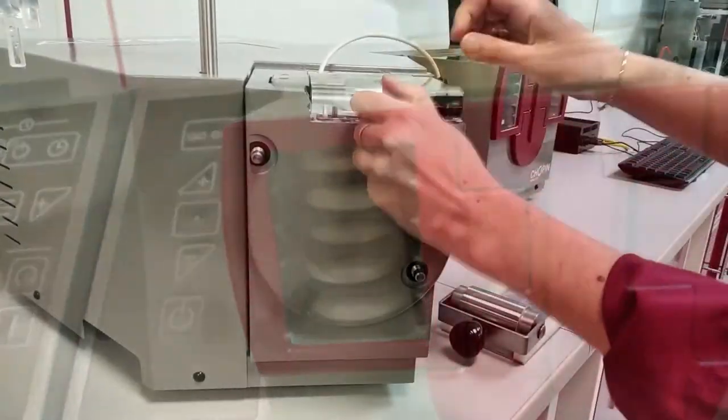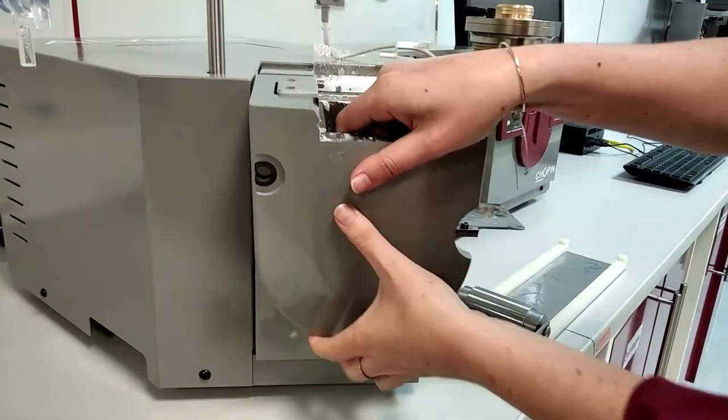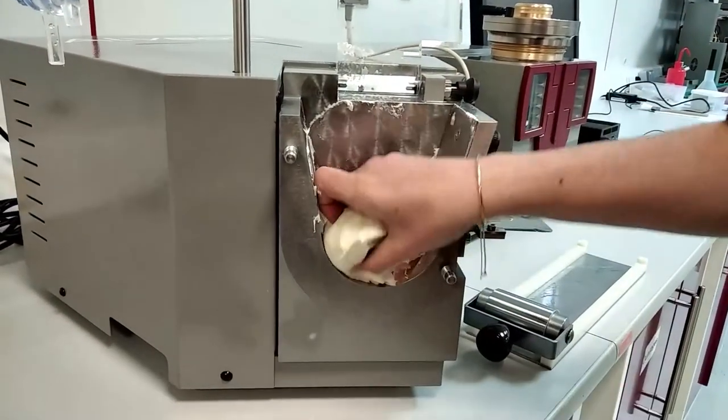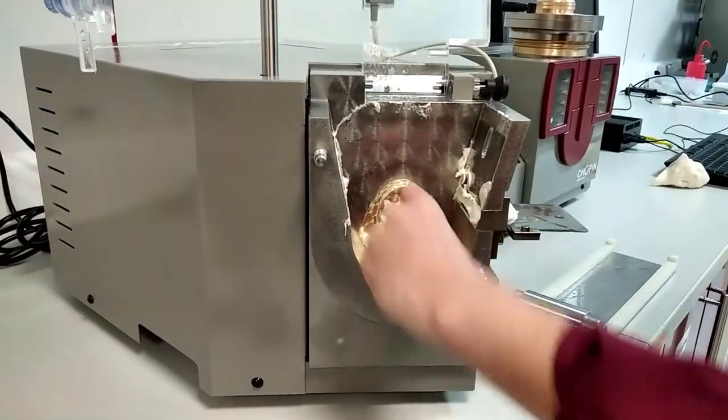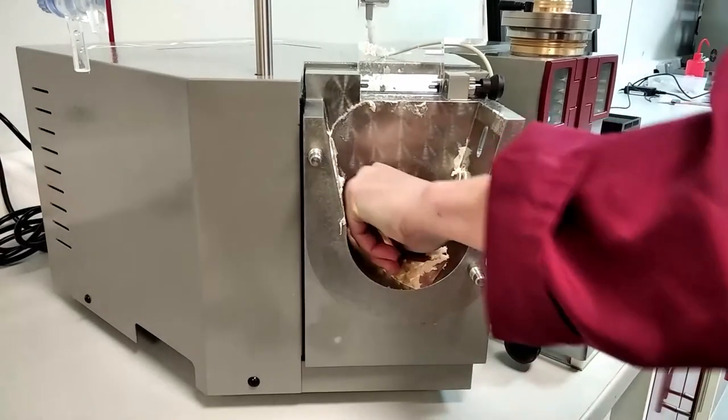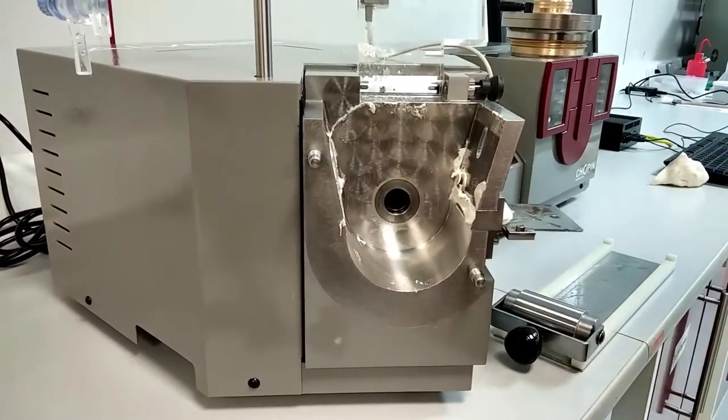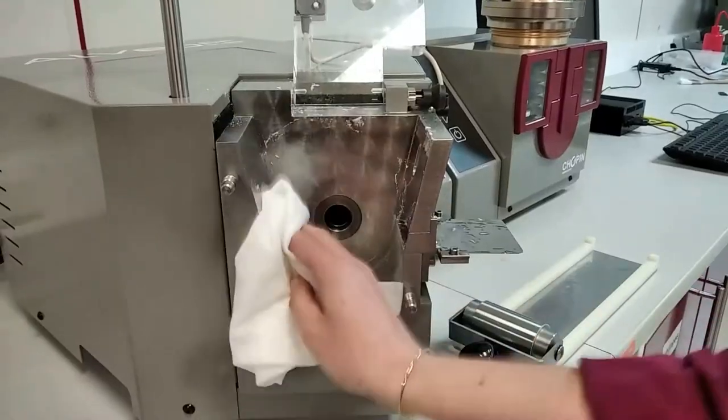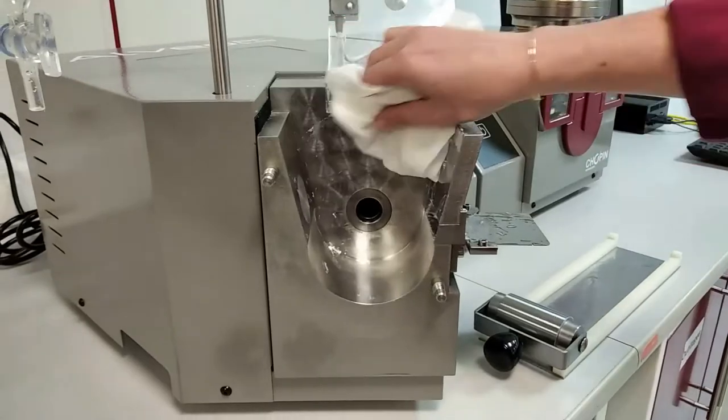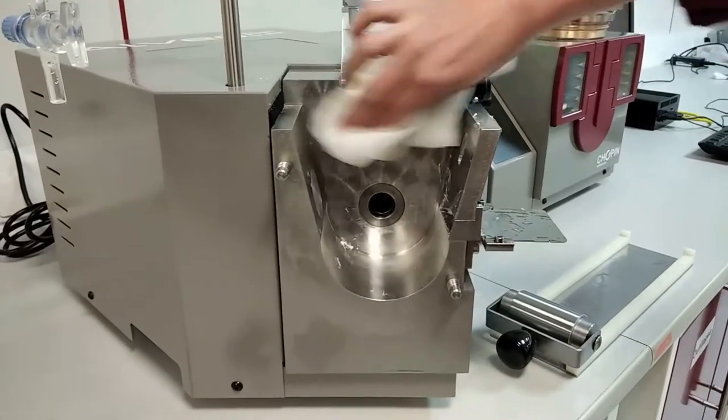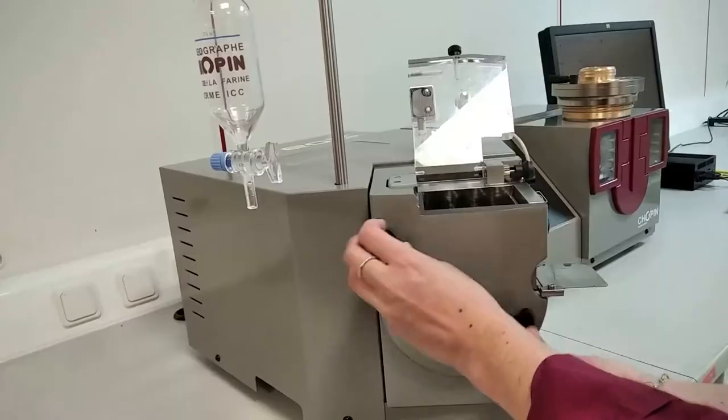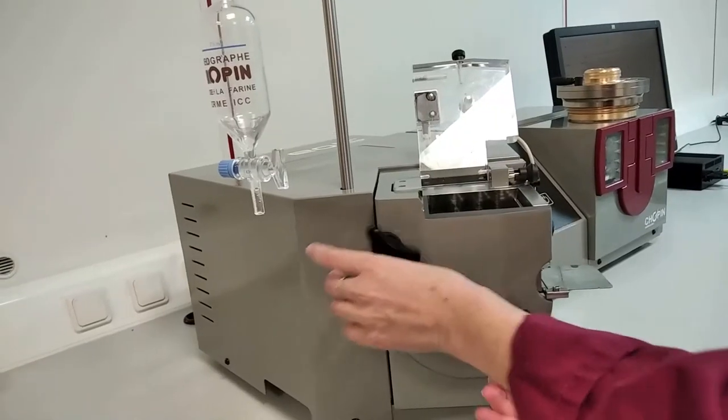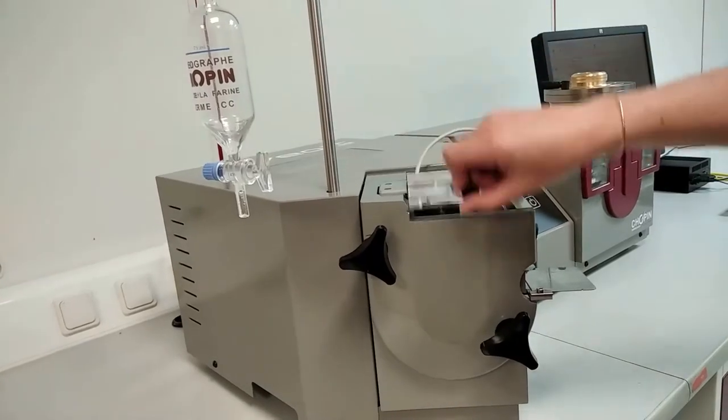You can take benefit of the resting time to clean the kneader. Remove the flange, the remaining dough, the F register and the blade. Immerse them into water and clean them carefully. Use a damp cloth to clean the mixing bowl. Once the mixer is clean you can start another test even if the first test is still ongoing.